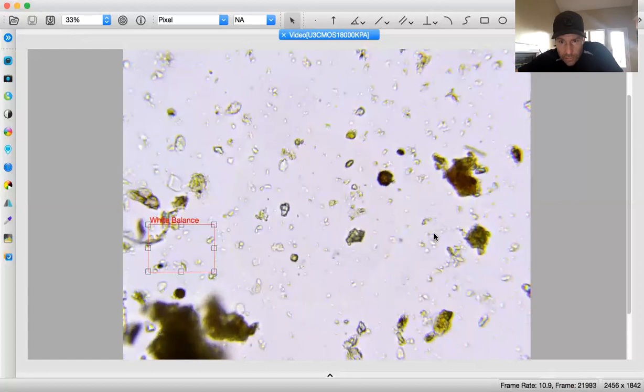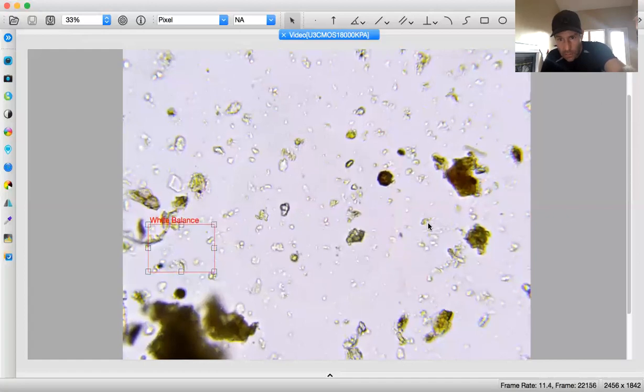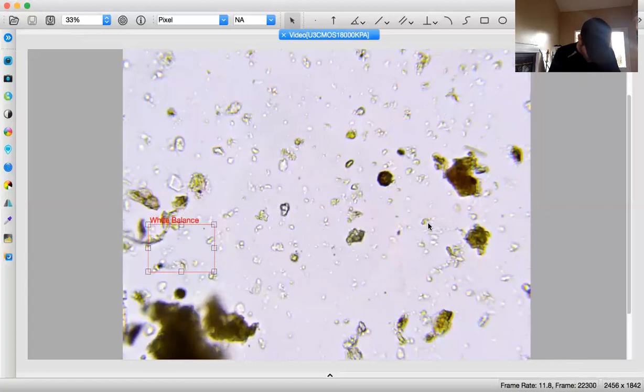So that's a filament of some sort, and it's less than 1 micrometer. So that's actino according to the school. So we're going to go what looks like, let's say 2, and then the mass in the middle. 1, 2, I want to say 2.5 is what I believe that mass represents. So actino would be 0.25.